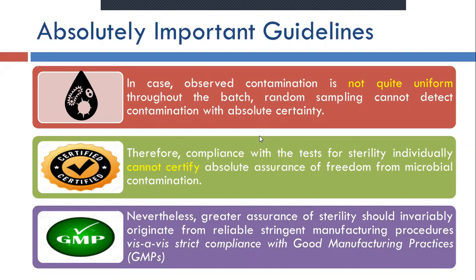When you manufacture with proper GMP, the chances of contamination in that product will be very, very less. Second, when you subject it to a strict and very effective sterilization process, definitely whatever the number of contaminating organisms, they will be killed and the product will be free from contamination. And third, the validation. What we have seen earlier: on what basis do we believe it? Because we have validated the sterilization process. Whatever sterilization process we are conducting has been validated and recorded.